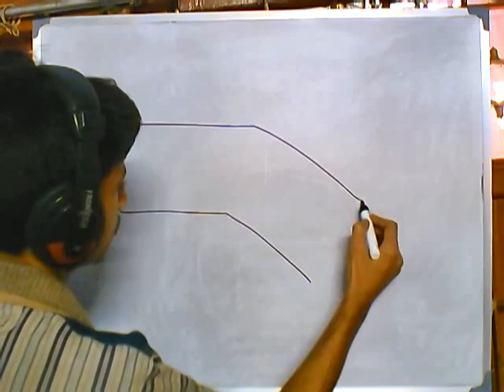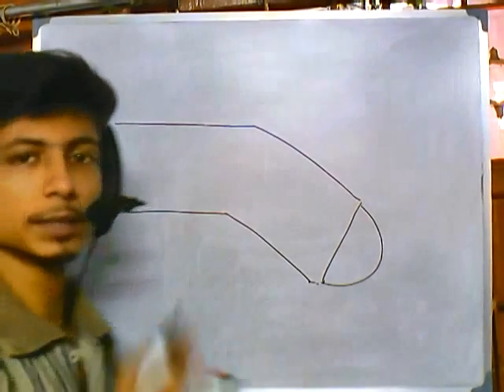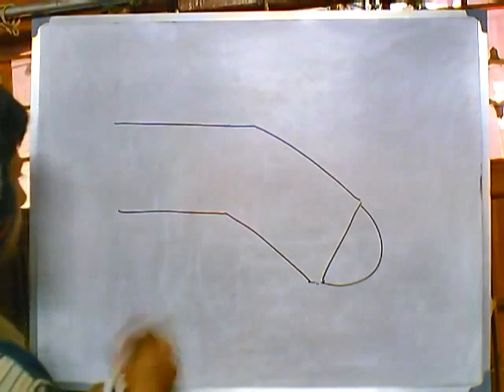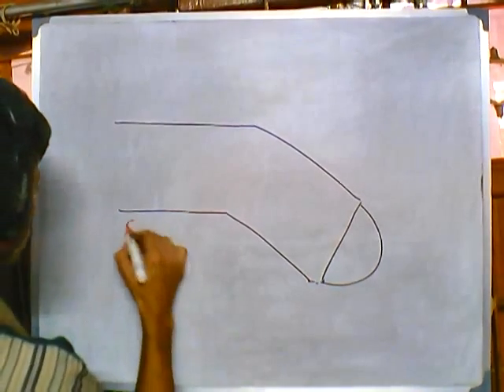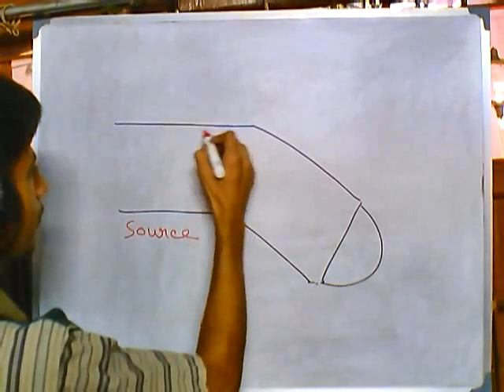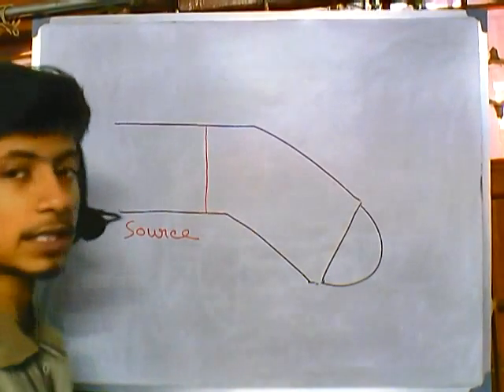After the analyzer region, at the end of the analyzer, we are having the detector. So this is the schematic presentation of the mass spec instrument. So at the beginning, this is the source, and this is the region where the particles are generated.